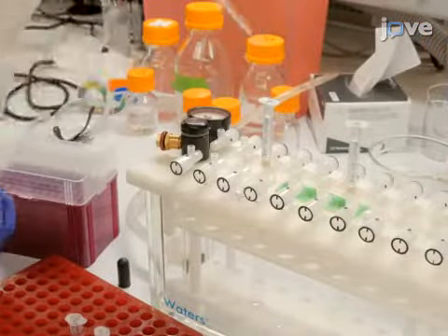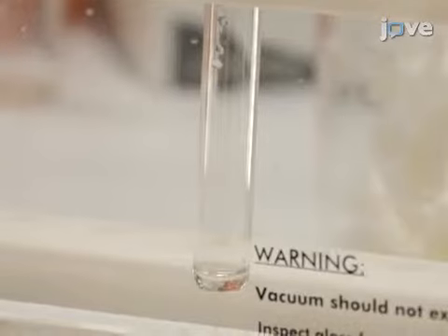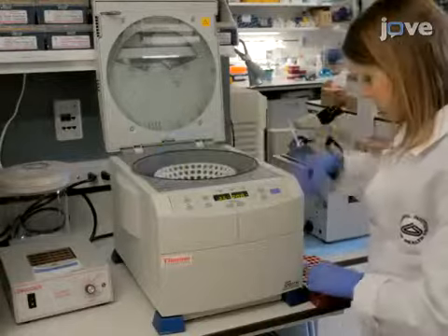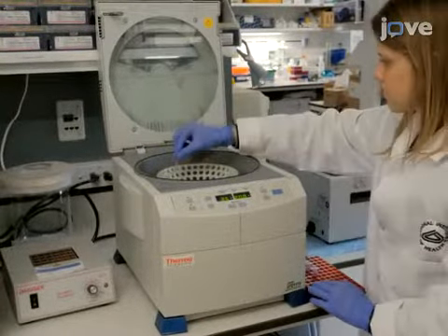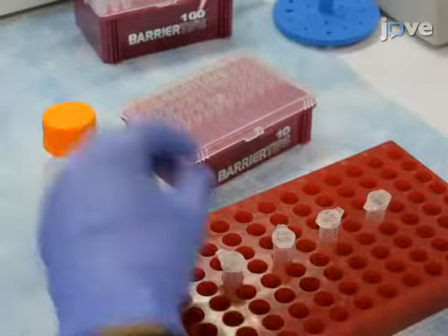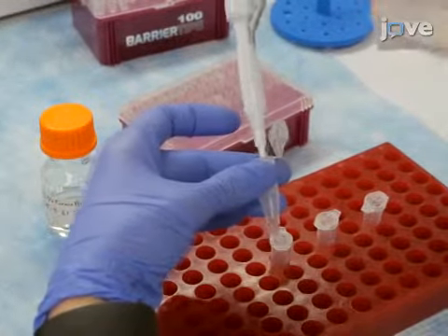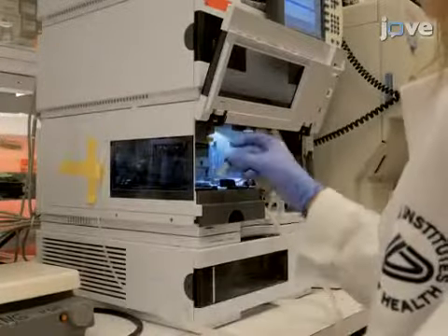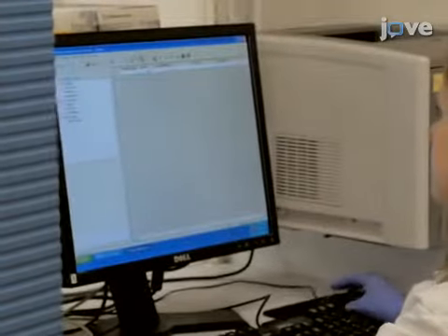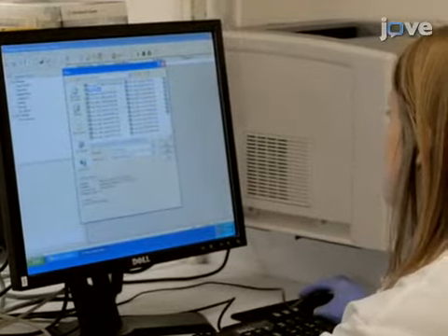Apply the sample and subsequently wash the cartridge with 1 milliliter of buffer A twice. Elute the peptides by applying 1 milliliter of buffer B slowly. Concentrate each eluate in a vacuum concentrator to a final volume of 100 microliters to evaporate away the acetonitrile. Then, add 2 microliters of 5% volume-to-volume formic acid in acetonitrile to each sample. Analyze the samples using qualitative LC-SRM as before. For quantitative LC-SRM analysis, run the isotope dilution series of each biological sample.